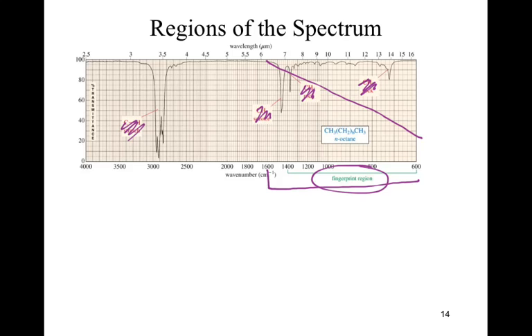Okay? So what we're going to be concerned about when we go through to evaluate our IR spectrum is ultimately the 1600 to 4000 range. Okay? That's where all of our primary functional groups will show up. That's where we need to look within an individual spectrum and evaluate what we see. Okay? And then interpret that based on what types of bonds those would be. Okay? This could be a really difficult process, except ultimately what you just need to do is match.